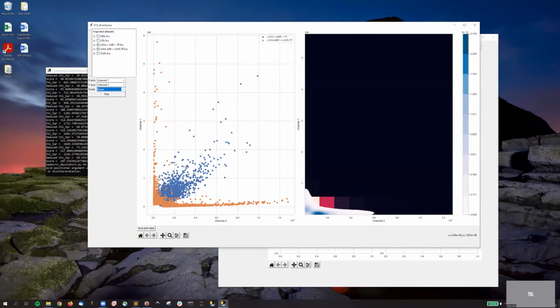So here you can see that the LUVs that are loaded with both types of dye occupy rather the middle over here, as in, for example, a colocalization plot. And the mixture of LUVs that are loaded only with one type of dye are stretching along the x-axis or y-axis. To see it a bit clearer, we can go to the log scale.